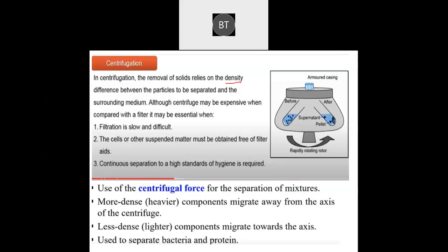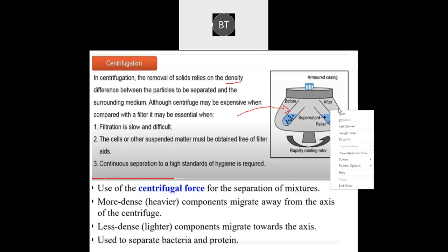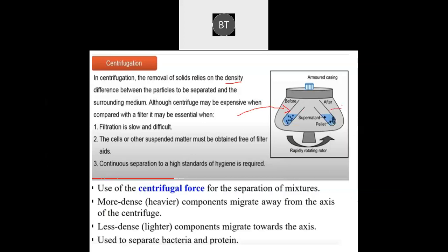It is an automatic process, wherein whatever products you're getting go directly into the centrifuge. The centrifugation occurs, and the important material you want can be easily removed.